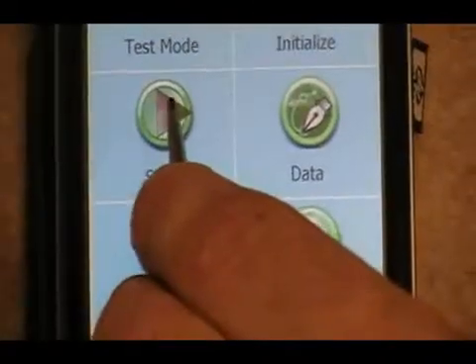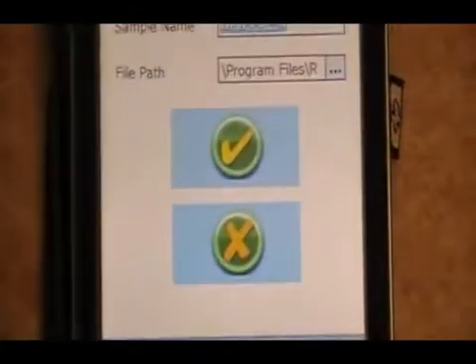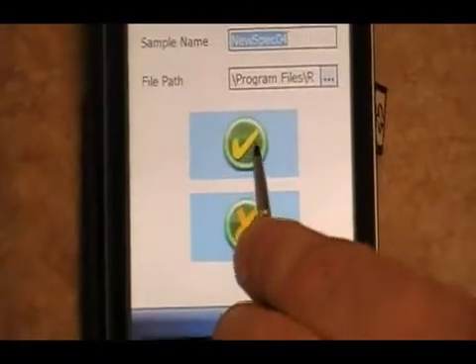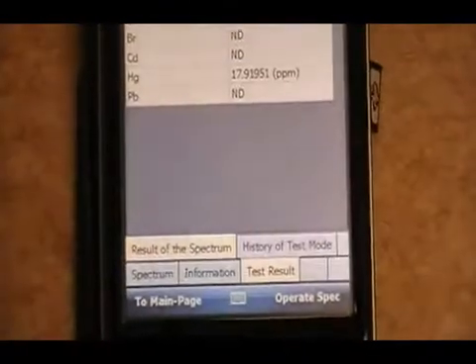Hit start. I'm again just going to hit the go key. I'm going to move to the PE low.